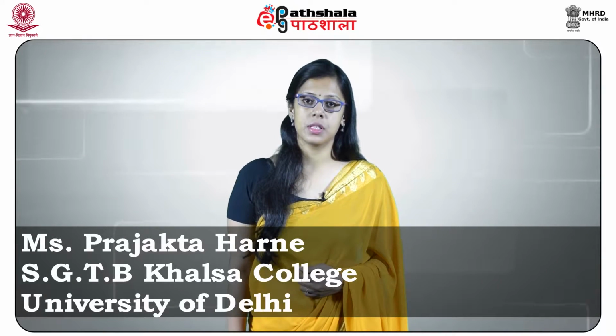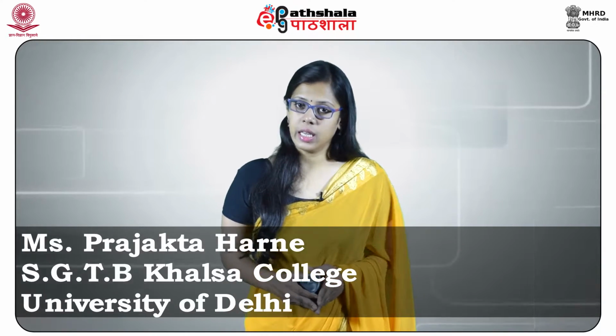Learning outcomes. After studying this module, you shall be able to know some important instruments and techniques used in forensic science. You will learn the fundamental principles of some important techniques. You will be able to understand the working of some important instruments which are used in forensic science investigation.